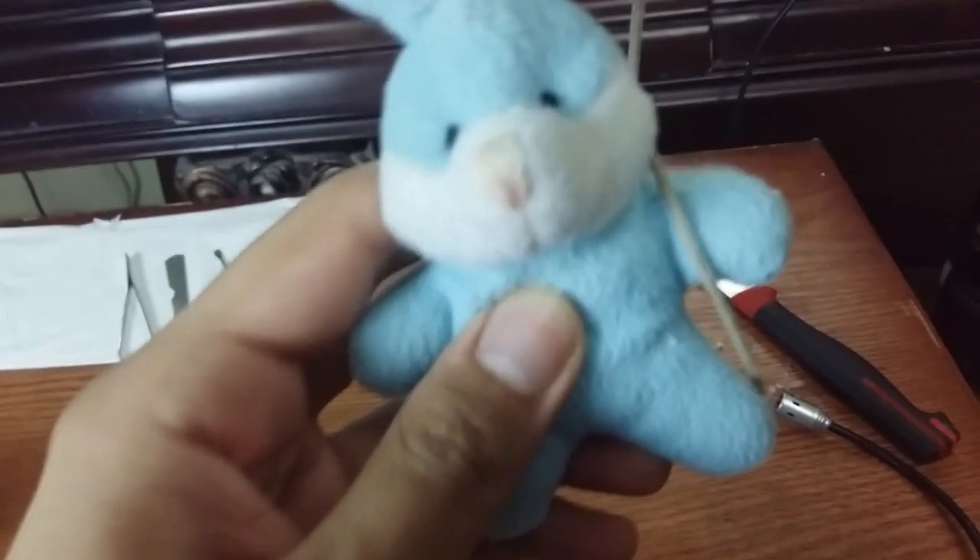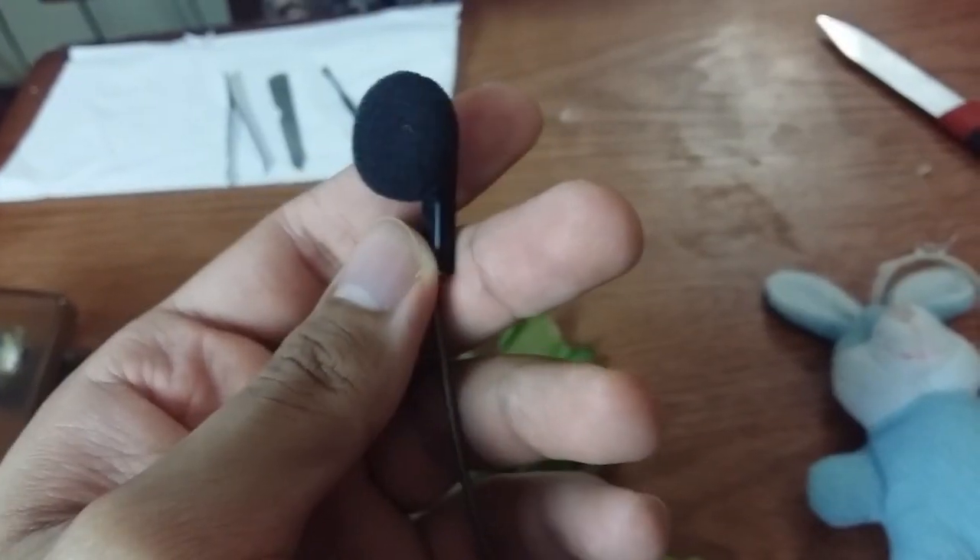The vegetables don't look so clear with this mini microscope. So now I will try with this bunny — I want to see the fiber of this hand piece. Let's try with the bunny first. It's full of hair. Okay, now let's see the headphone.